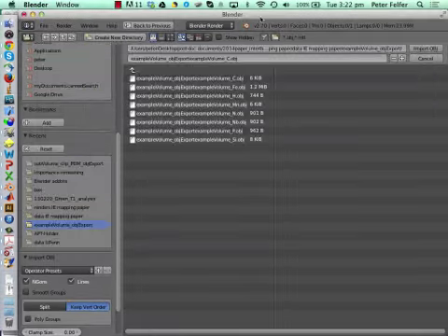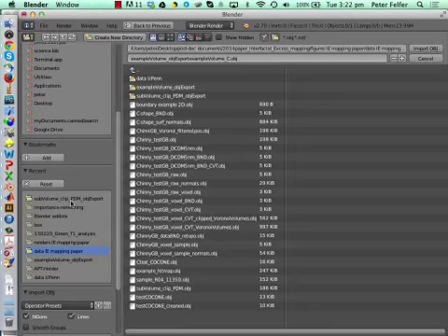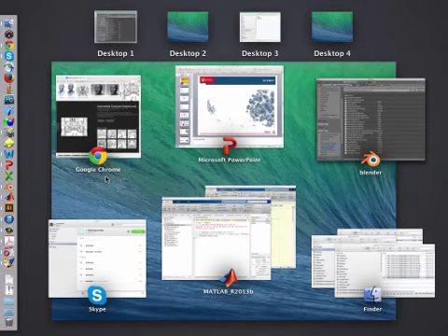So we can go back into Blender now and find it. Hang on, we'll need to copy the files across for the people who find that. It does work. And I just did it.